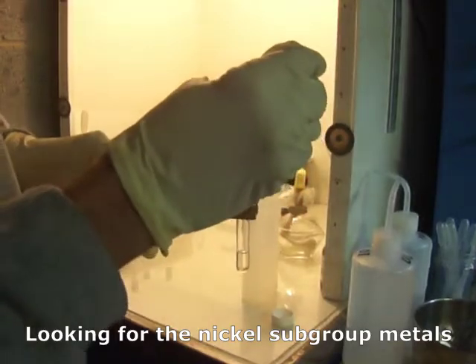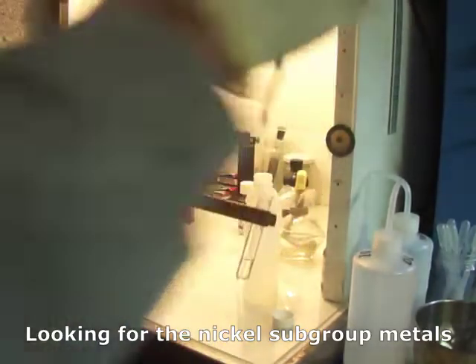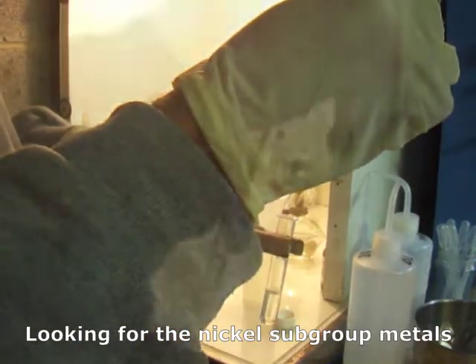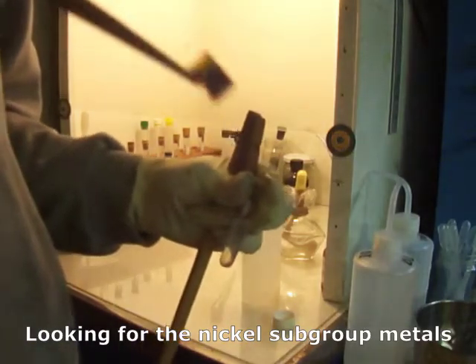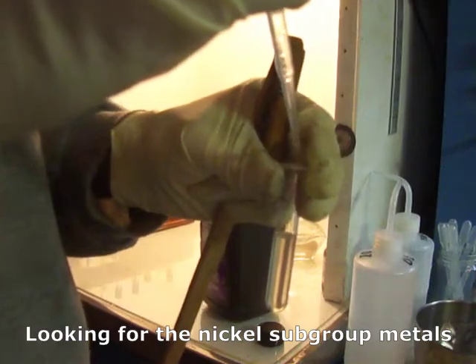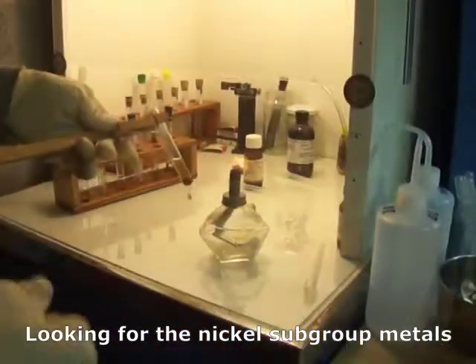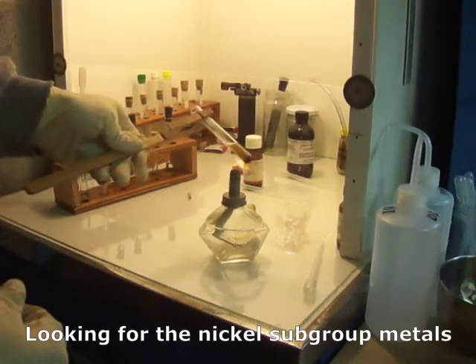Now we make it strongly alkaline with 8 molar sodium hydroxide. No, still acidic. Nope, still acidic. Alright, now we're basic. Now we add hydrogen peroxide. Mix for 1 minute. I did put it in a larger tube, and we're supposed to boil for 2 minutes.